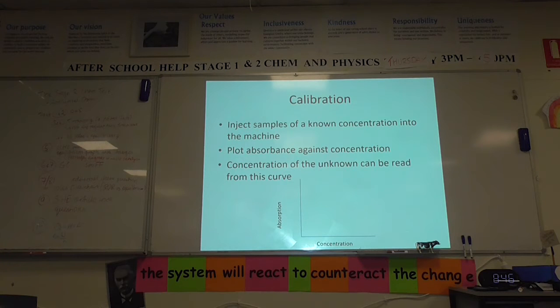Well, that was 9 years ago when I put that in there. Because it said inject, and like you don't inject samples of a known concentration. You get the tiny little capillary tube and you drop it in there. I've actually done that.